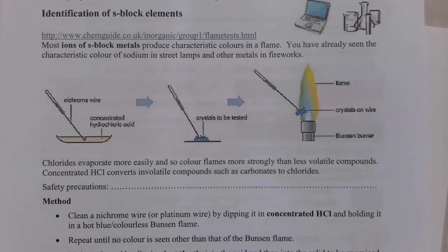In this last video in the groups 1 and 2 topic we're going to be looking at flame tests. You need to know the flame colours for the different compounds, but you also need to be able to understand why different elements or different ions produce different colours. So we're on page 17 of your notes, looking at the flame test that you're going to do in class. A couple of very important things that you need to be aware of and need to be able to describe if you're asked how you would carry out this experiment.